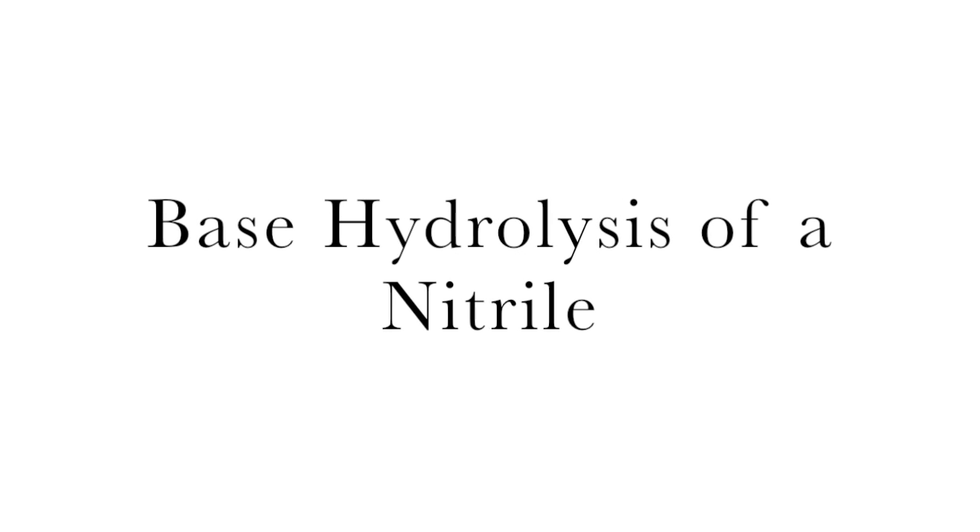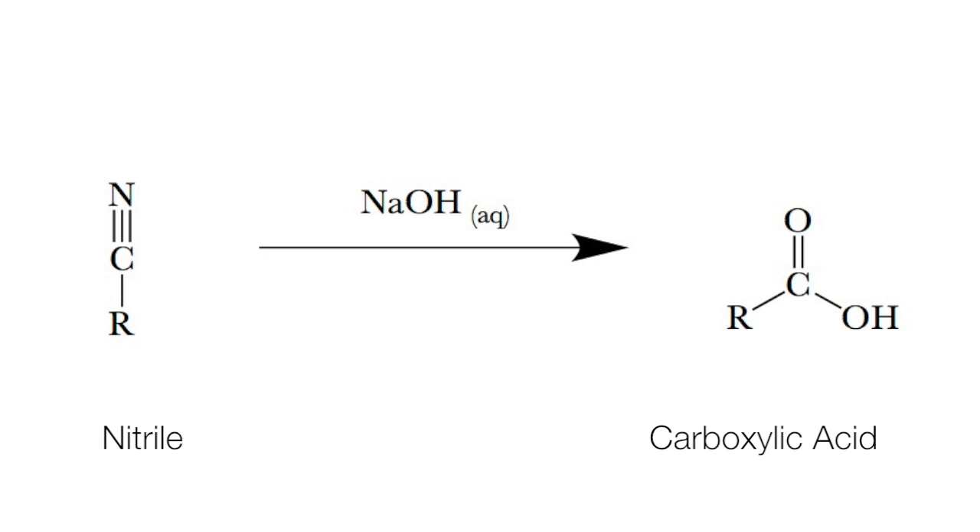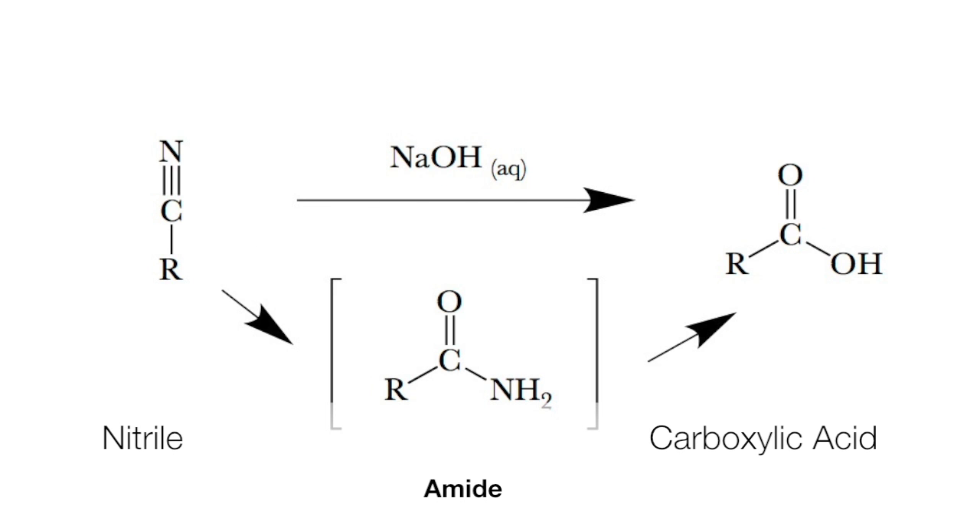Base hydrolysis of a nitrile. Today is a relatively simple experiment, but it has a long waiting time. A nitrile is a functional group containing a C-N triple bond. By exposing it to an excess of base, we're going to turn it into a carboxylic acid. It does go through an intermediate, which is an amide.